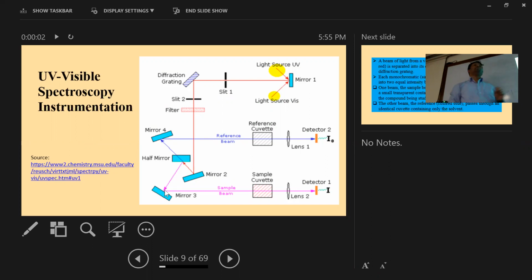It can be made of different types of materials depending on what type of sample you want to analyze. It can be made of plastic if it is not reacting with anything, just like water. Then we can use glass, or even sometimes quartz. Quartz is a kind of glass, high quality glass. So we can use different types of cell.